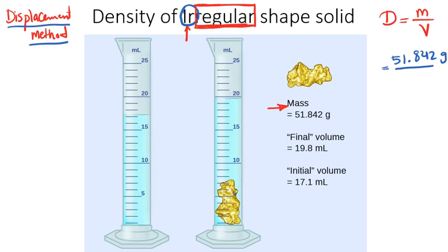I'm going to measure the volume of water. It's up to you how much water you add. I added this amount of water, I call it V1. Let me measure the volume of this. This is 15, 16, 17, and a little bit greater than 17, so I'll say 17.1 mL.